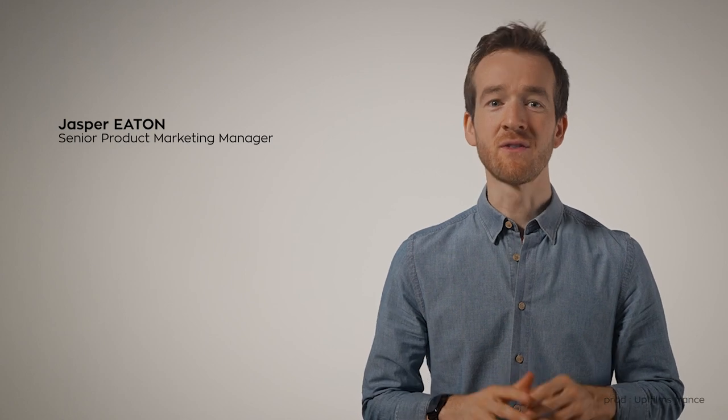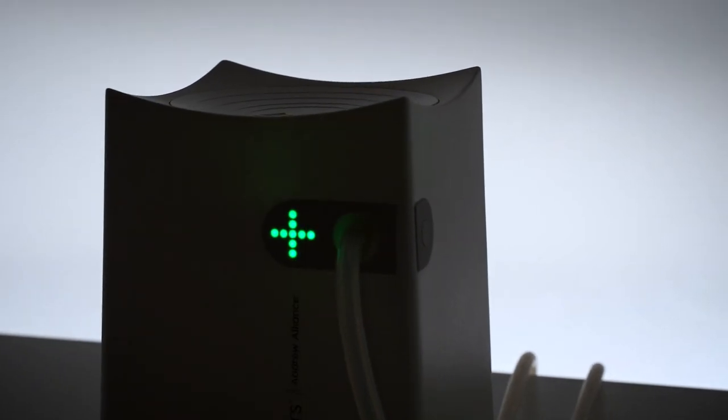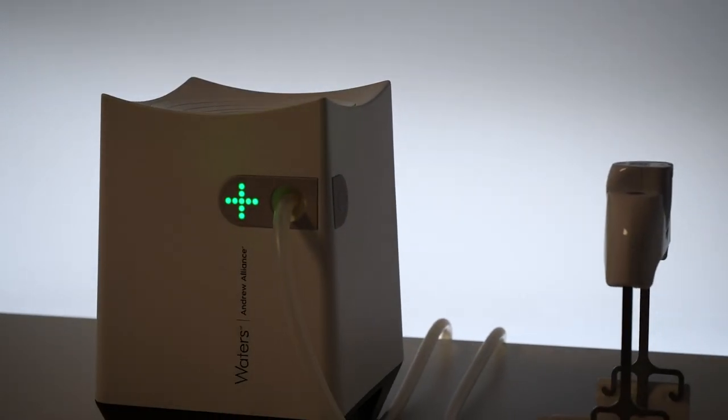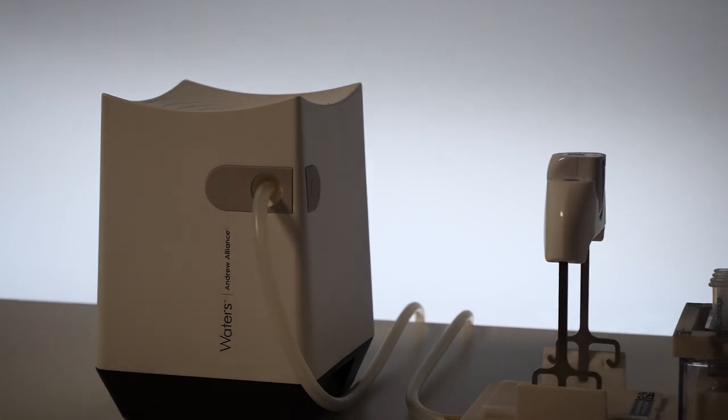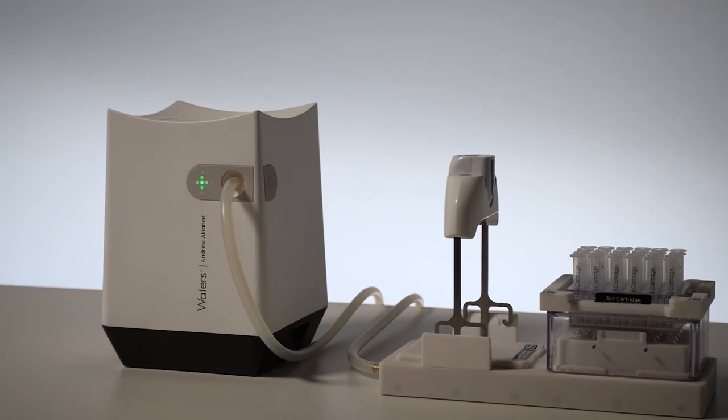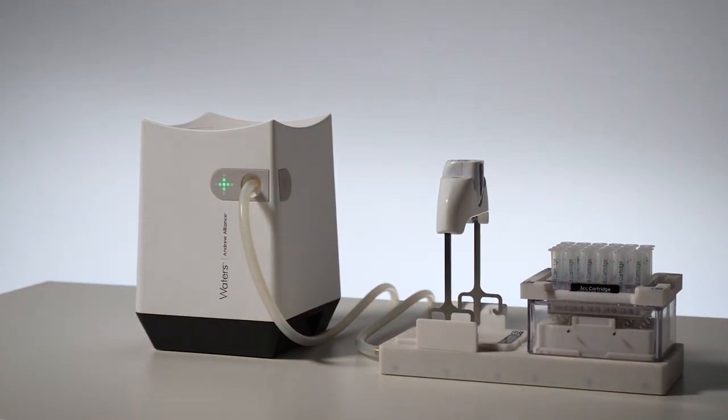The Extraction Plus device is an all-new approach to solid phase extraction methods by providing a fully automated solution for some of the most complex workflows in this space, all while maintaining our signature ease of use and intuitive approach to device programming. In this video, we'll address its main features while discussing important considerations.